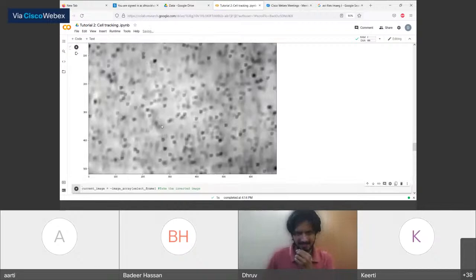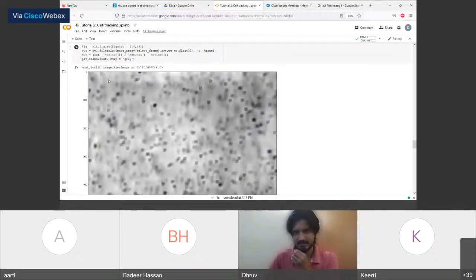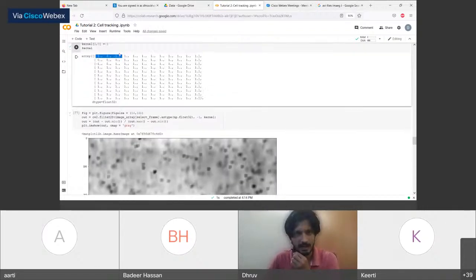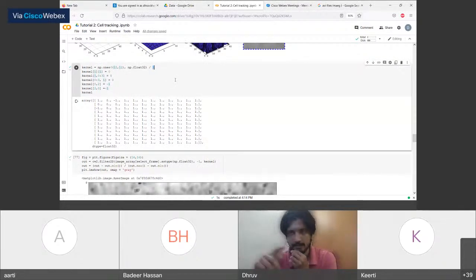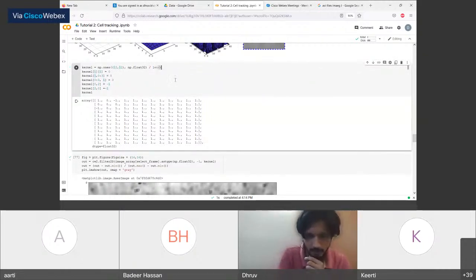What you saw is that at every pixel value, I'm doing some transformation. So I can create something called an averaging filter. I'll create a 12 by 12 filter, and I place each value as the mean over the total length.